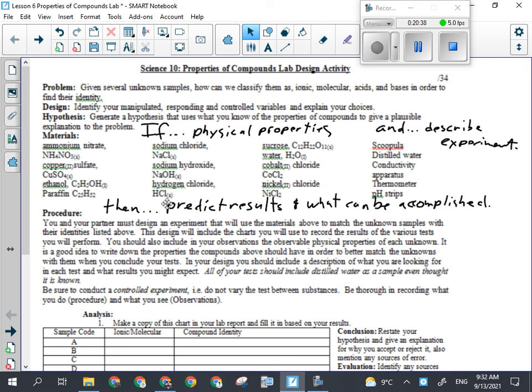And should you tell people how much to put in here? Since we're not measuring this by mass, we want to do our best to make sure we get the same amount, but we're not going to measure it. Could that be a source of error? Possibly. How much should I fill each one of these? Tip of the scoop. I wouldn't even say 2, I'd say 1/3.